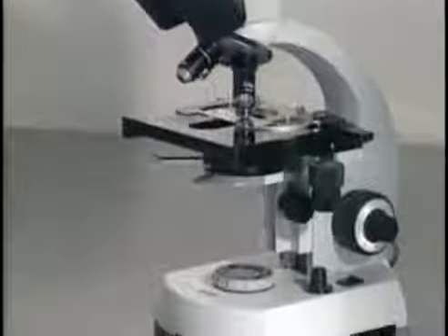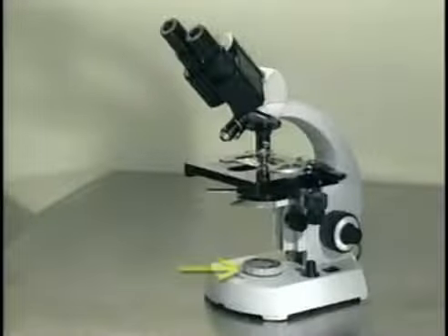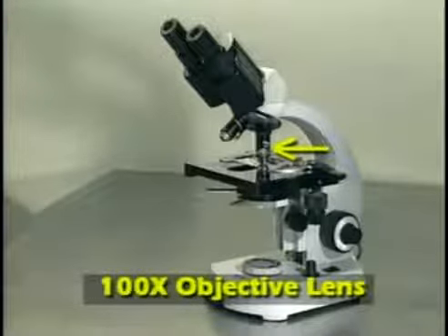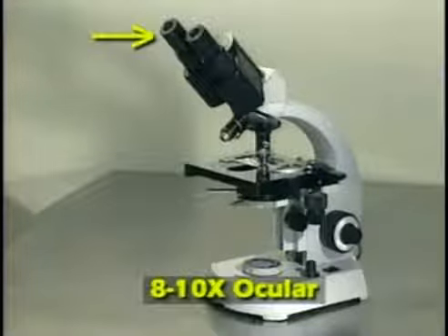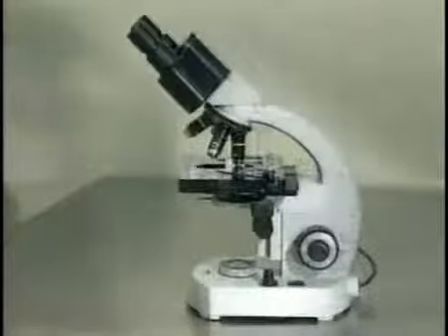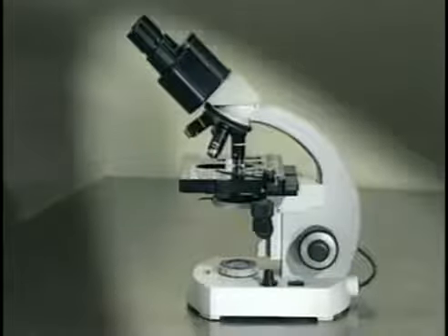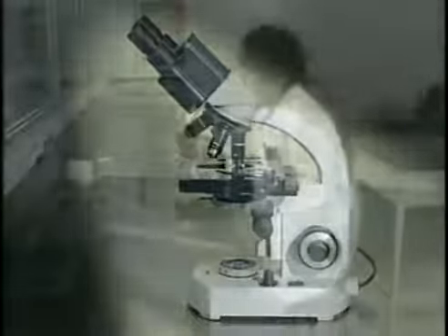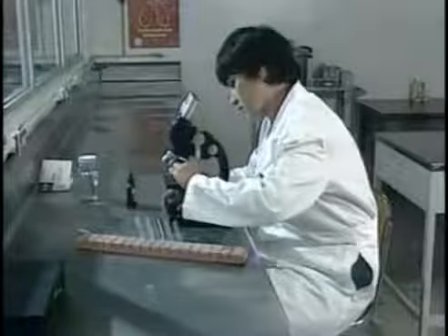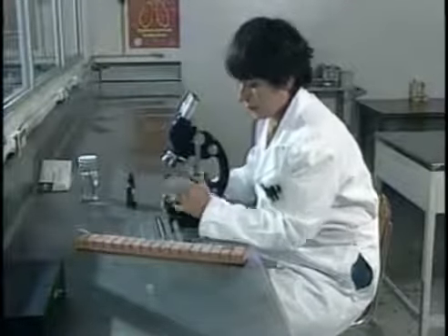A good quality binocular microscope is recommended for reading TB smears. It must be equipped with an electrical light source or mirror, an oil immersion or 100x objective, eyepieces of 8 to 10x magnification, and a mechanical stage. Daily care and cleaning are essential to avoid dust, oil buildup, and moisture. An area of subdued lighting is preferable for reading slides. However, if no electricity is available, daylight must be used as a light source and the microscope should be placed in front of a window.